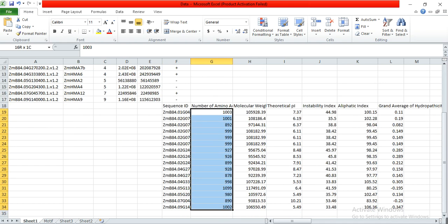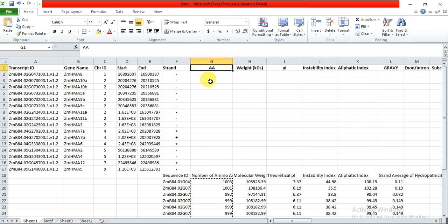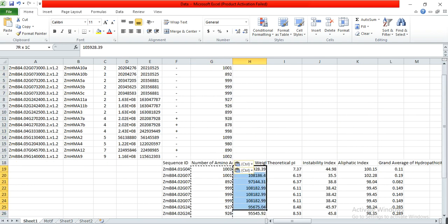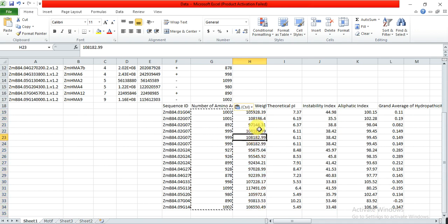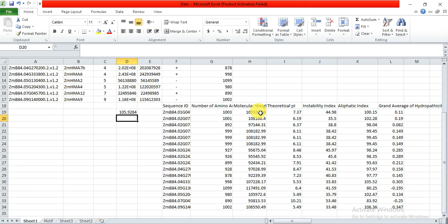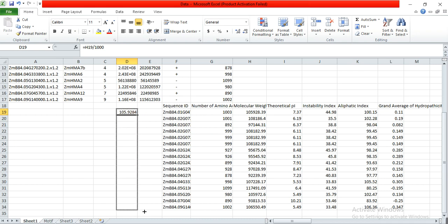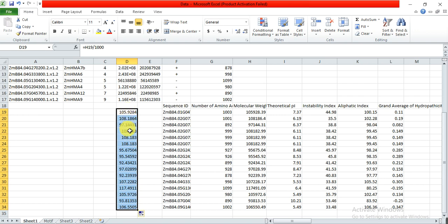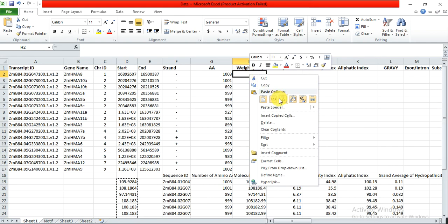Copy all the amino acid numbers and paste them into the amino acid column. The weight is in Daltons, so we need to convert to kiloDaltons by dividing by 1000. Write an equal sign, select the molecular weight cell, divide by 1000, and drag the formula down when the corner shows a black plus sign. All values will become kilodaltons. Copy and paste as values into the appropriate column.